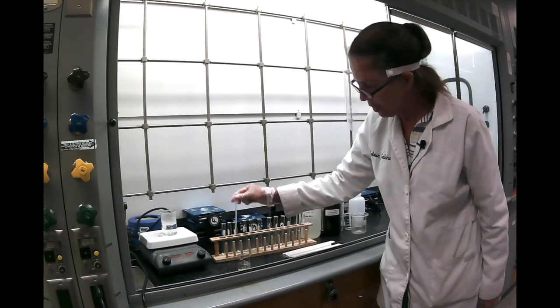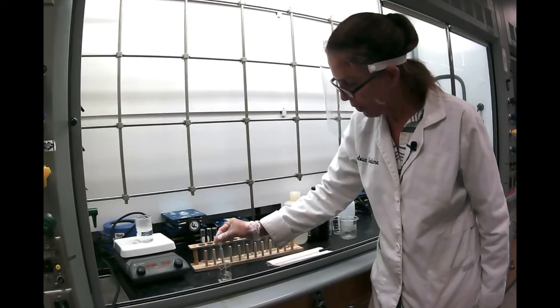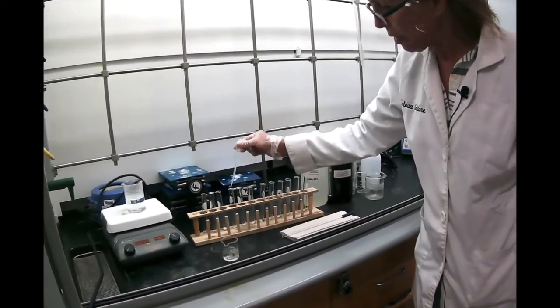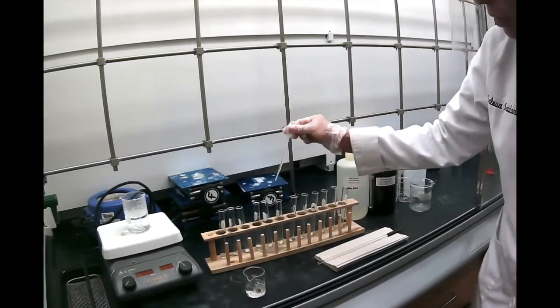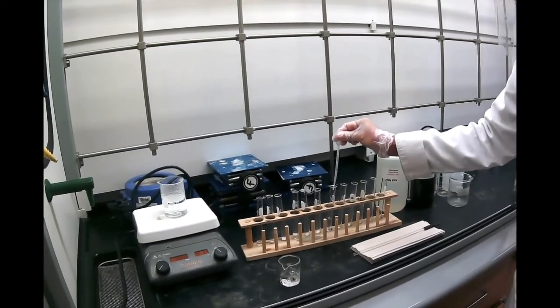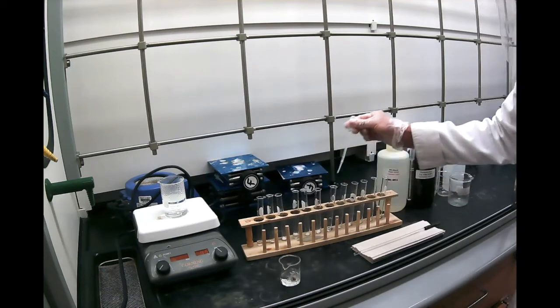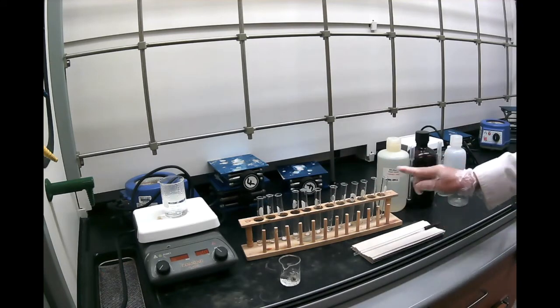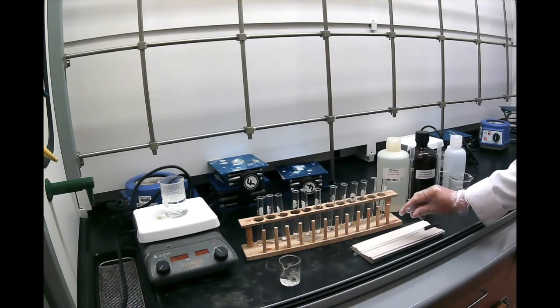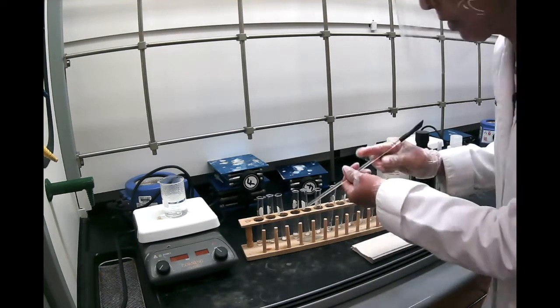So 1 milliliter of water in the resorcinol, 1 milliliter in the naphthalene, 1 milliliter in the benzoic acid, and 1 milliliter in the acetanilide, which is this one. Okay, now the first samples have water, and we want to see how they dissolve in water.